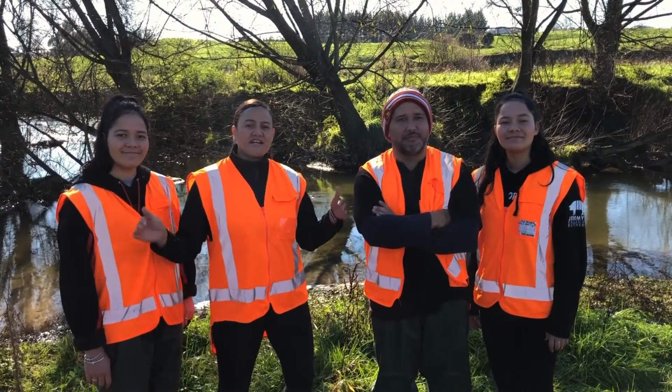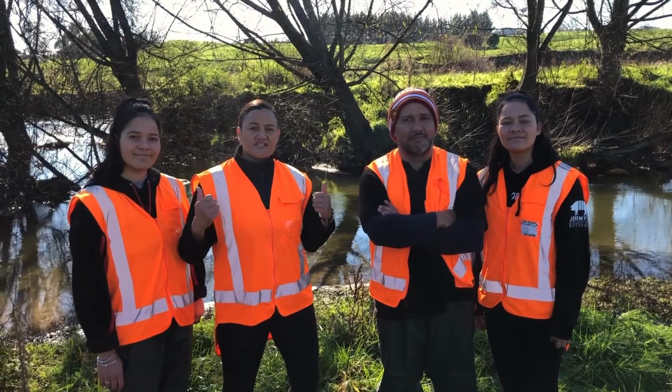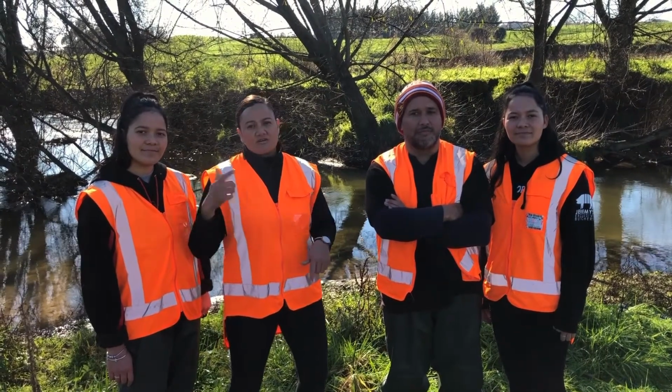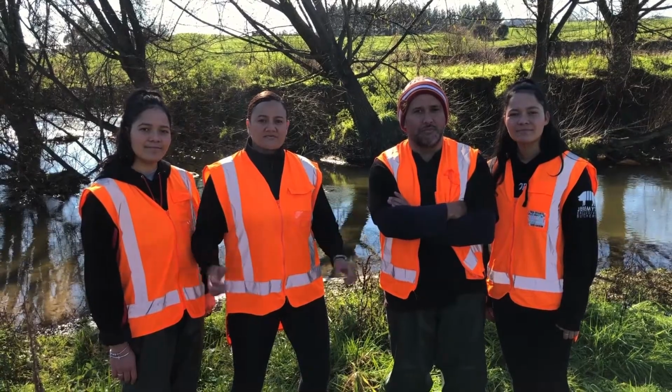So that's us whānau, we're done here for the day. We encourage you to go grab your SHMAK kits, go down and test your water, and we want to monitor this over a period of time, gather a whole heap of data and information so that you can look at what different things are happening around your waterways.